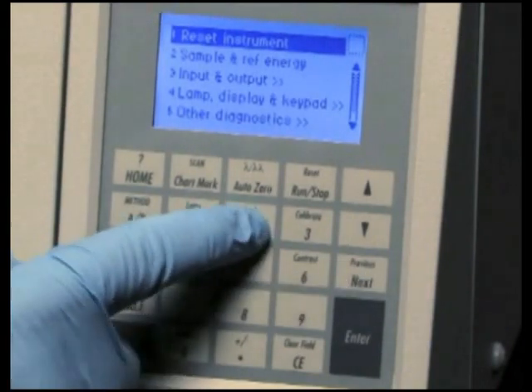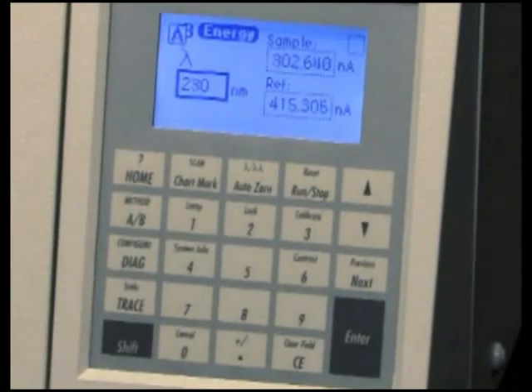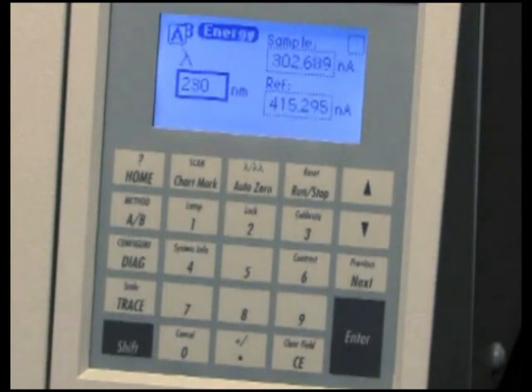Selecting Sample and Reference Energy allows you to view the sample and reference energy displayed in nanoamps on channel A or B.